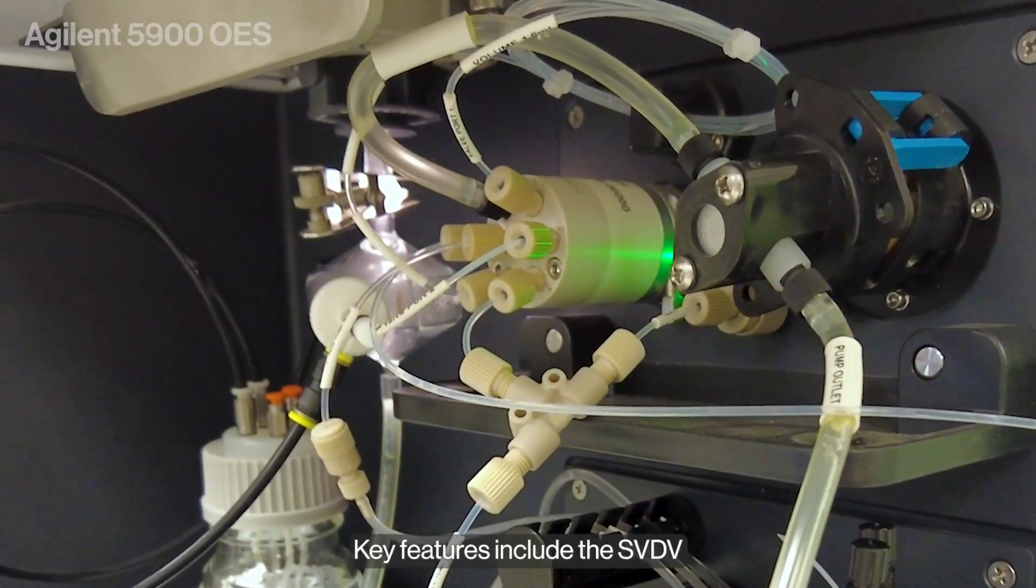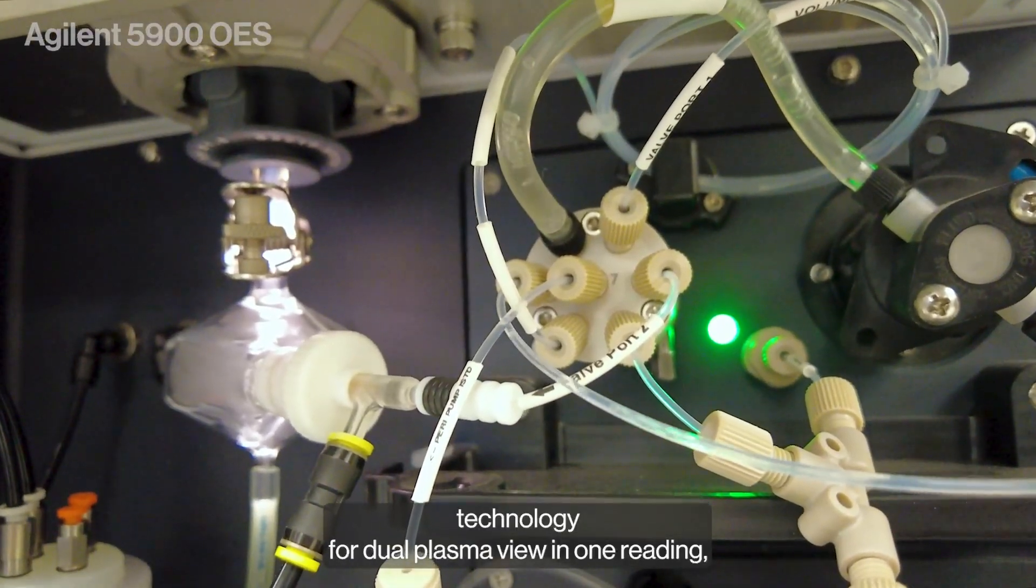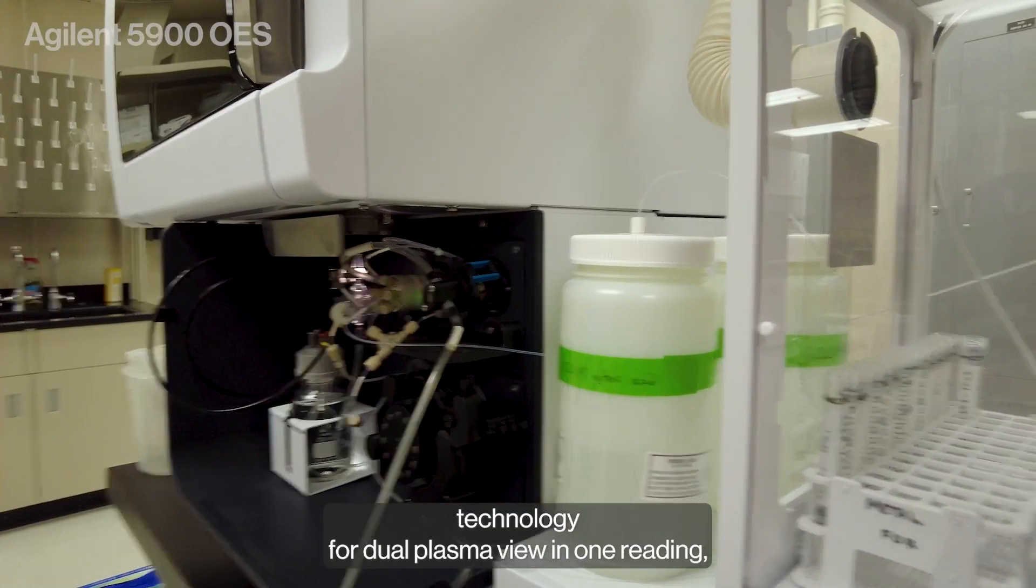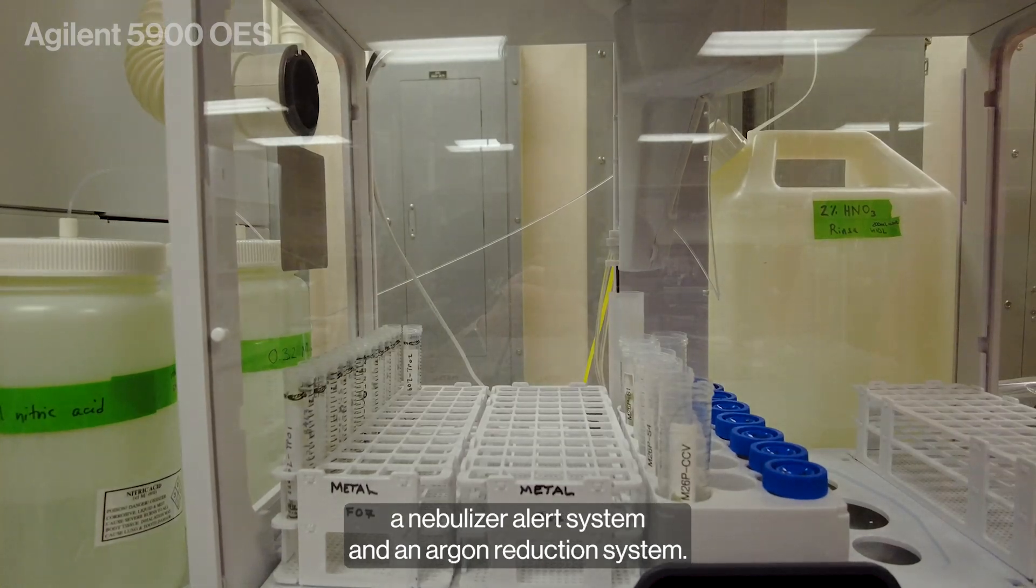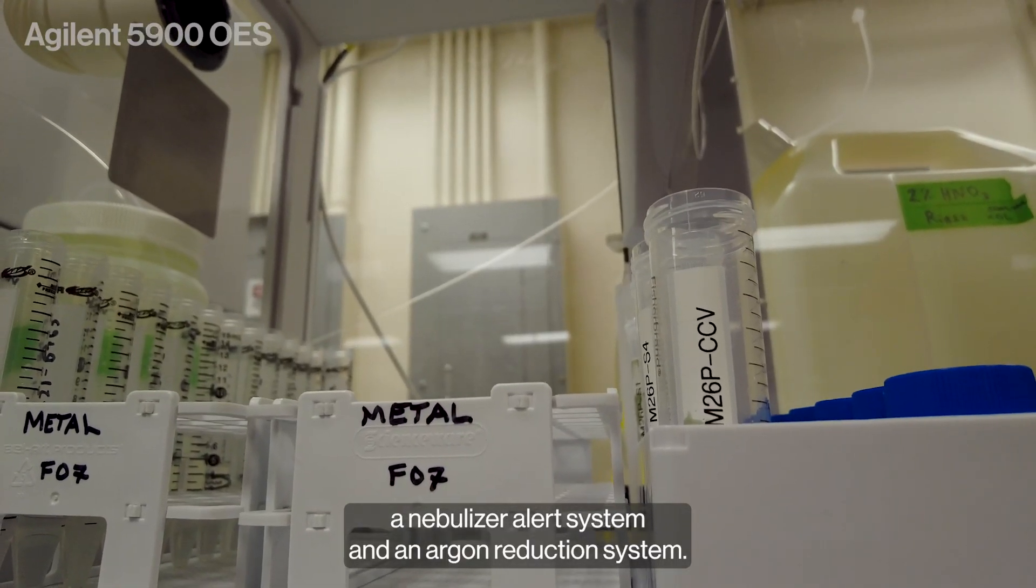Key features include the SVDV technology for dual plasma view in one reading, a nebulizer alert system, and an argon reduction system.